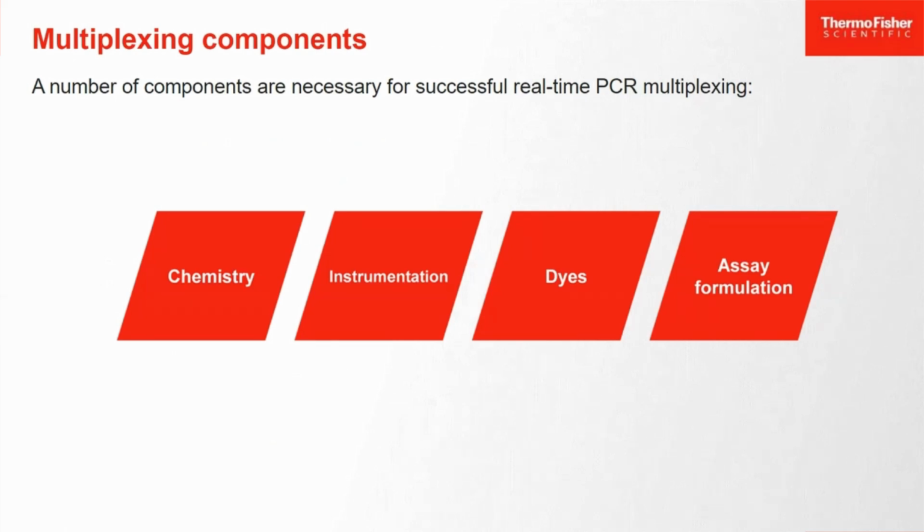Let's say you've decided, yes, I'm going to multiplex. What components do we need for successful multiplexing? Chemistry, instrumentation, dyes, and assay formulation. And I'll talk about each of these.